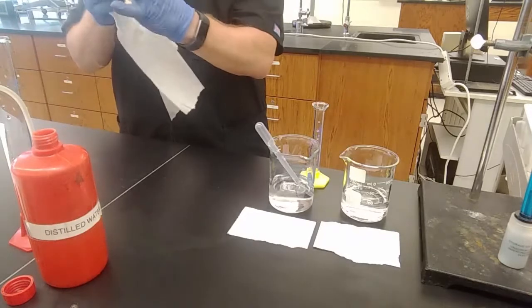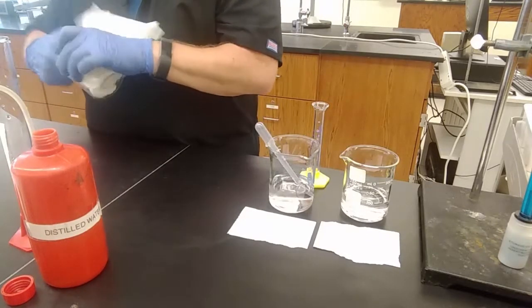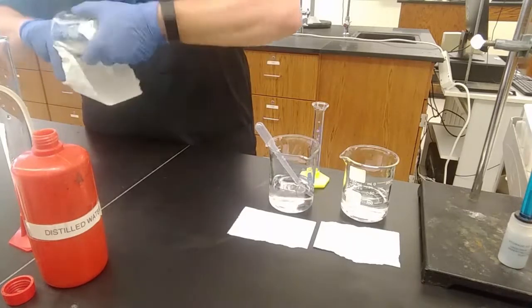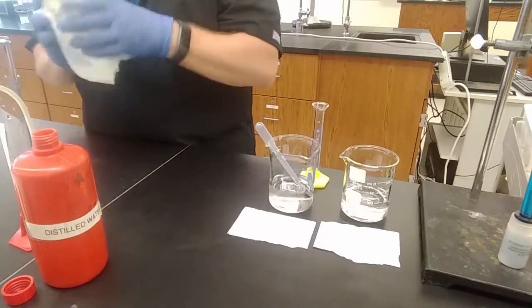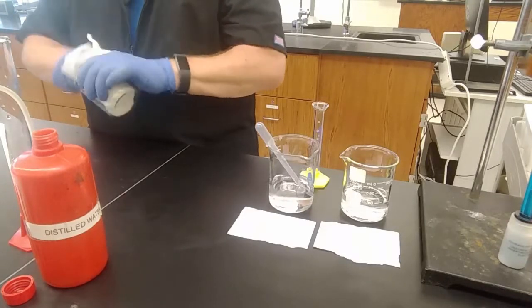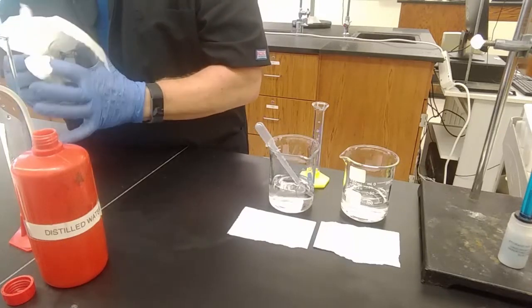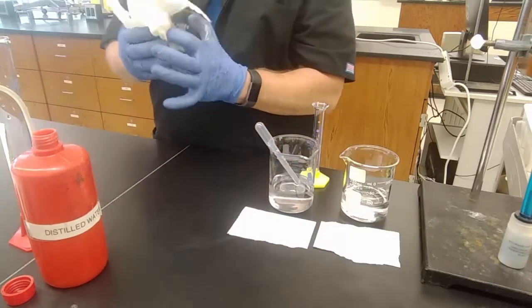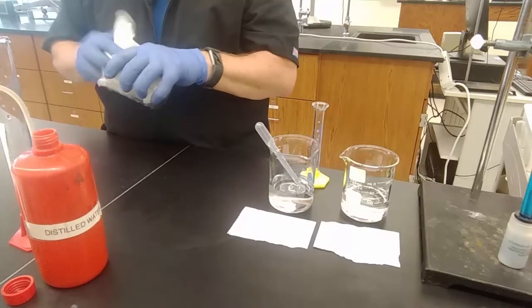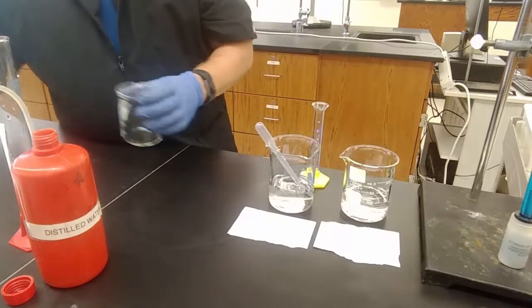I'm not going to just take 10 milliliters and 90 milliliters, approximately, to dilute it by a factor of 10, which was diluting it from 0 to 1. I want to dilute it this time by a factor of 100. I don't want to end up with a whole bunch of beakers here. Like 14 beakers is a pain in the neck. So we got it down to 9.